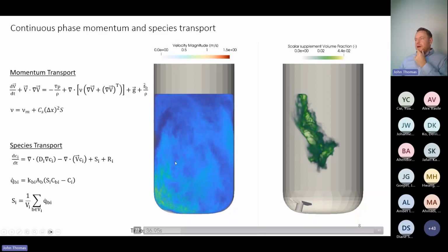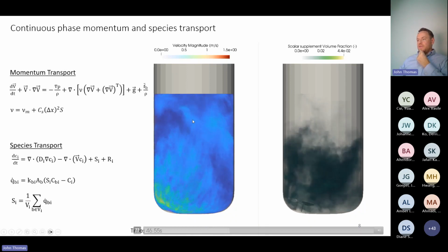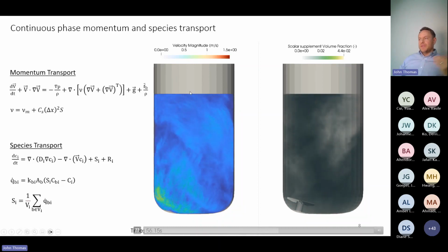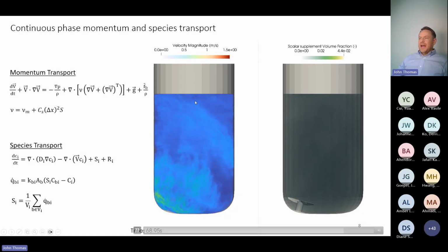So here's what the 2,000 liter vessel looks like. Here's the fluid flow. We'll watch this guy cook. It's interesting to see the different patterns we get. We are going to get a region of poor mixing in the center here, where there's a torus. I ran two simulations, one with a free surface, one without. I didn't see a huge difference in my KLAs, probably because my vessel was only maybe 1.5 meters deep, as it were, the fluid level. So I chose to ignore the free surface in most of the simulations because of these impeller speeds, which is about 60 RPM. There wasn't much to write home about.